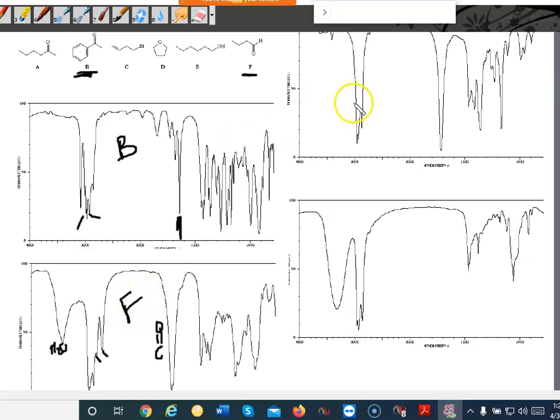All right, and then this one, aliphatic carbonyl. You have a bunch of junk up here. I cut it off. You can't see, but that's pretty much water up there. So that would be for A. This would be compound A, and then this would be your alcohol. This would be E. All right. Questions on that one?